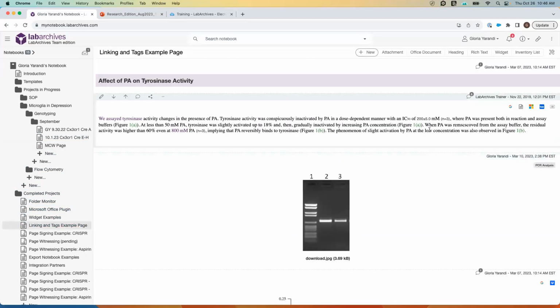With links, you also have the opportunity to link out different sources. Like for example, I have an entry where I link out a link from Google, links from my notebook, my OneDrive, and also my Box account as well.